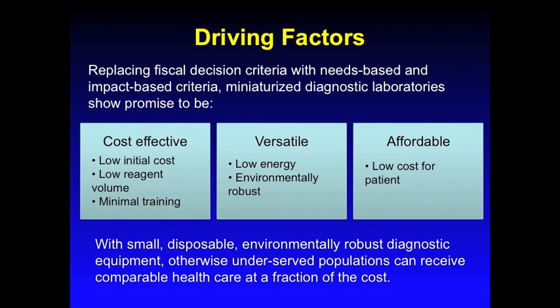Replacing fiscal decision criteria with needs-based or impact-based criteria, miniaturized diagnostic laboratories show promise to be cost-effective through low initial and reagent costs, and versatile, consuming little to no energy, resulting in affordable, low-cost diagnostic testing. This, of course, can have profound implications on otherwise underserved patient populations.